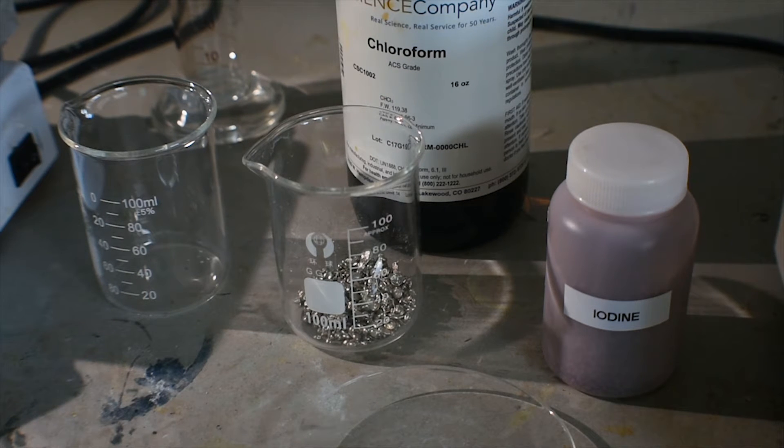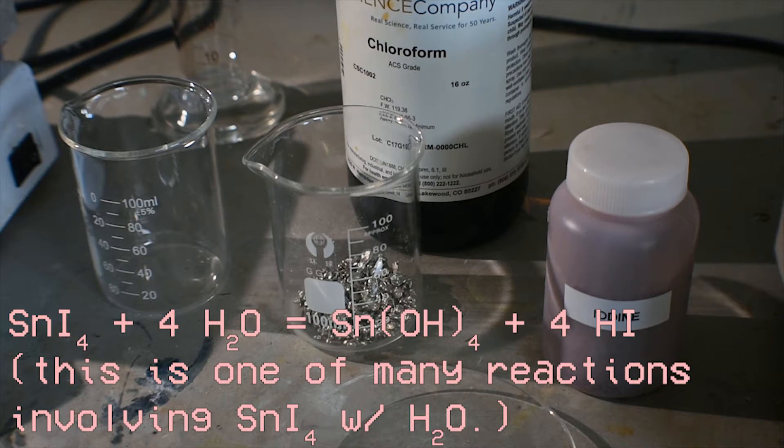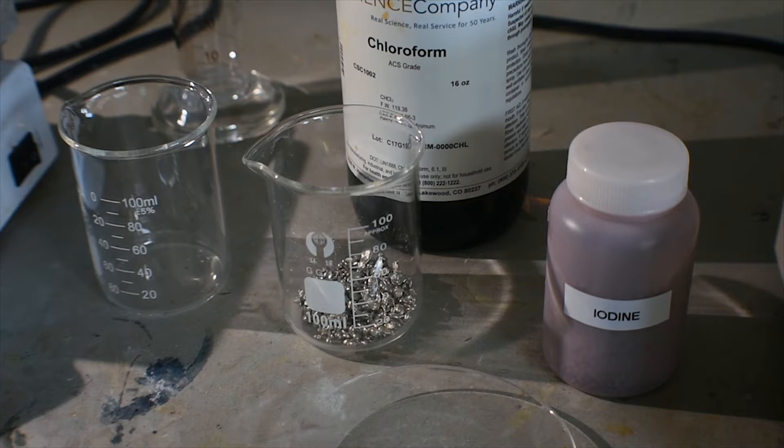Like most tin 4 compounds, tin 4 iodide is hydrolyzed completely by water, forming a near clear solution. The synthesis of tin 4 iodide is much simpler and more straightforward than that of tin 4 fluoride, chloride, or bromide.